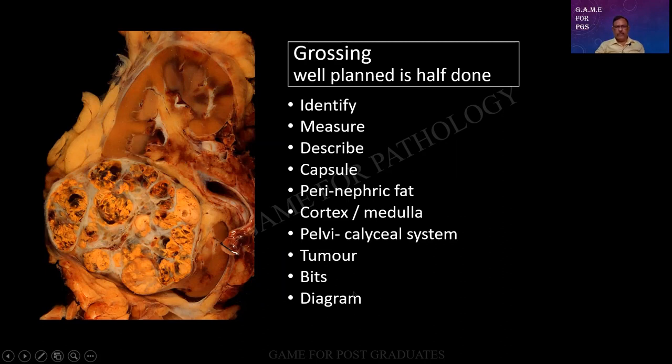Diagram is always mandatory. For students, postgraduate students, please develop this habit. Draw a diagram so that your colleague or the faculty will not have any doubt whatsoever about what you have done.